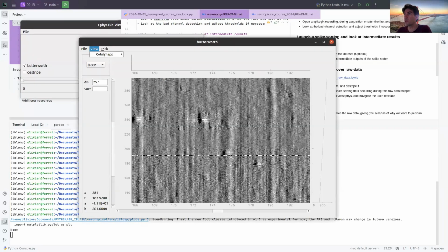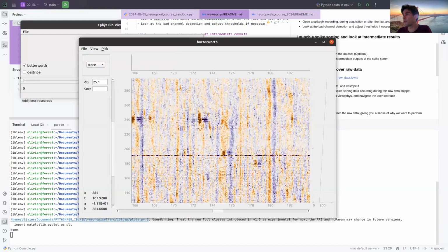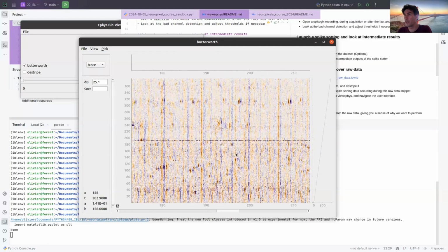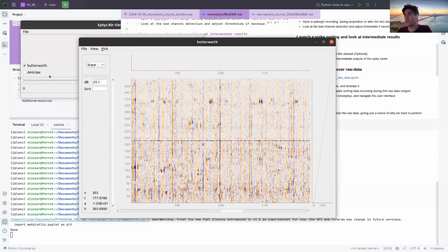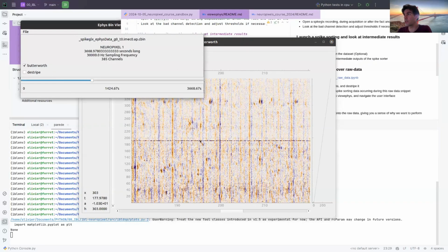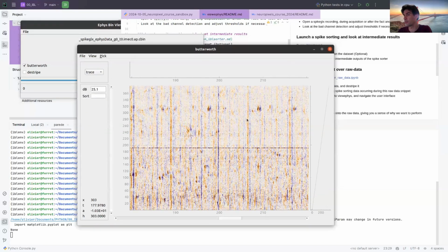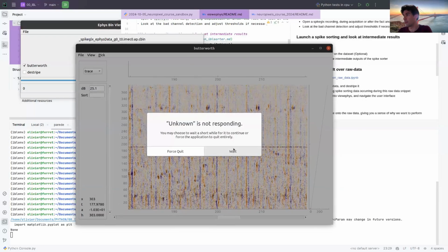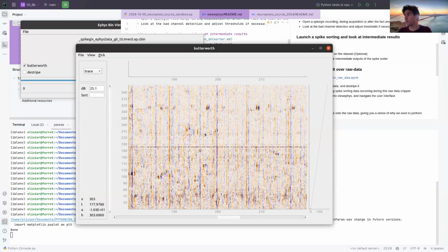The idea then was to play a bit with the display, to put a different kind of color map so that we can look at the recording, and then to move along the recording to try to find some interesting part of it. Here, the display is a bit slow with zoom.